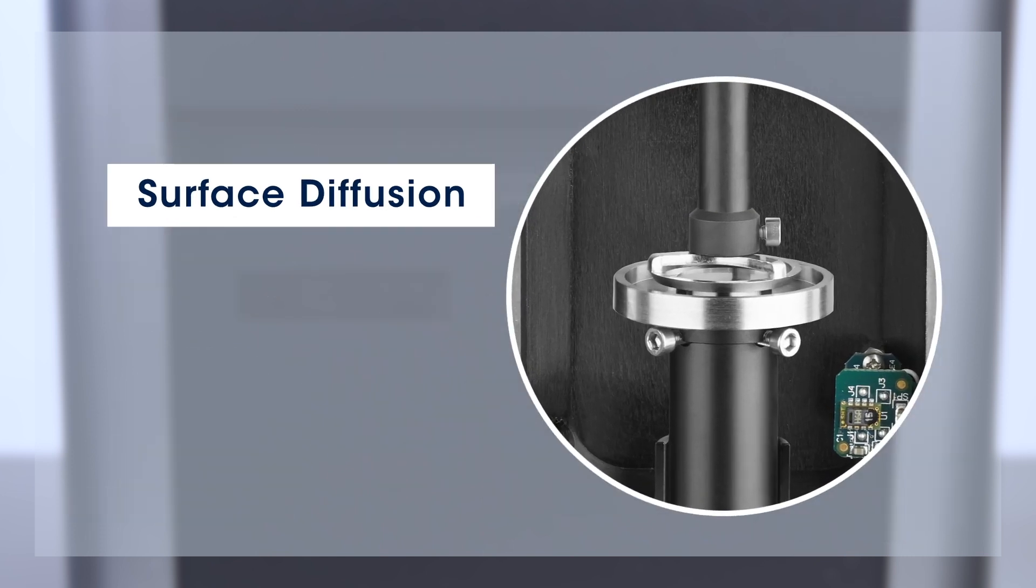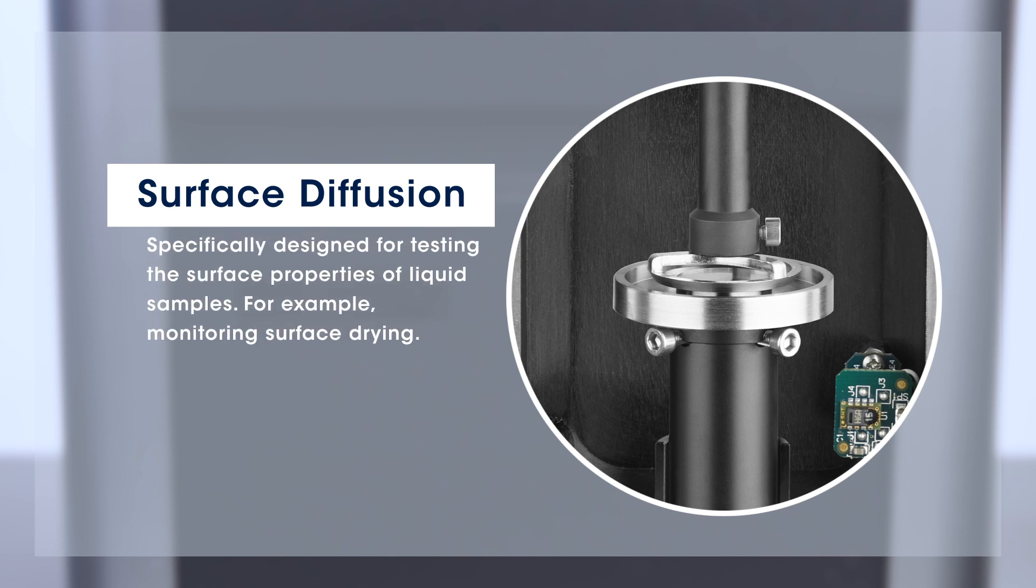Among them, the surface diffusion geometry is specifically designed for testing the surface properties of liquid samples, for example, monitoring surface drying.